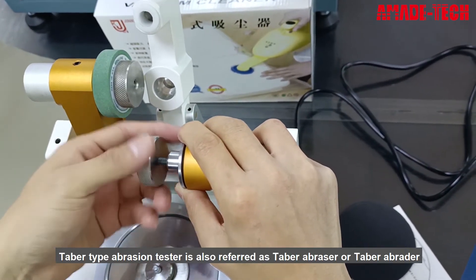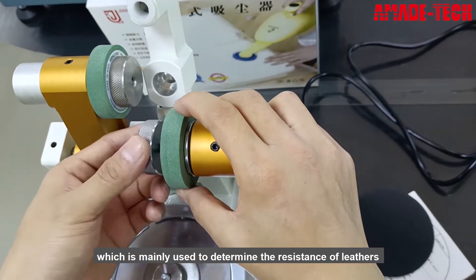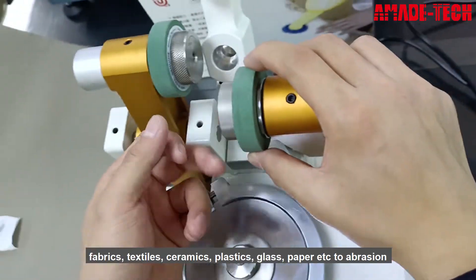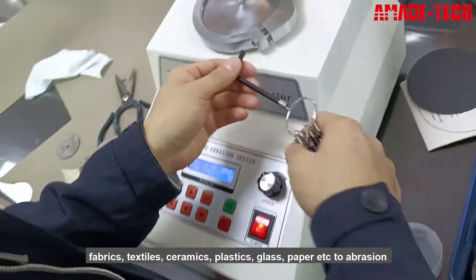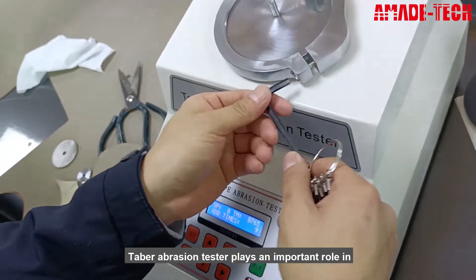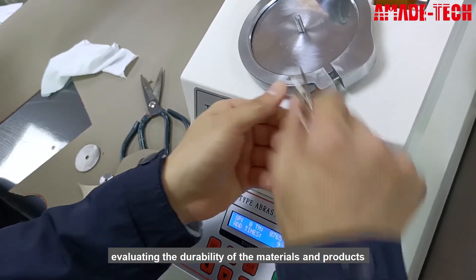Tabor type abrasion tester is also referred to as Tabor abrasor or Tabor abrader, which is mainly used to determine the resistance of leathers, fabrics, textiles, ceramics, plastics, glass, paper, etc. to abrasion. Tabor abrasion tester plays an important role in evaluating the durability of materials and products.